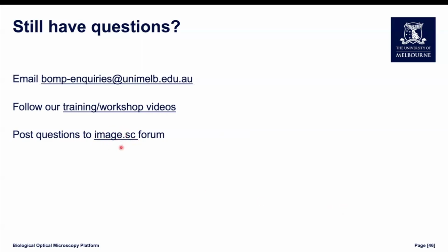That is a central forum for lots of the open source data analysis packages, of which Fiji is one. If you do encounter any problems with Fiji, that's a very good place to go to. Very often people have encountered these issues before and have posted the questions and have had answers in terms of how to fix it. Thank you.